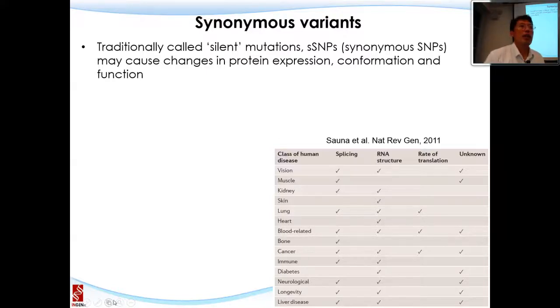Yes? These variants are not considered non-synonymous variants? Which part? The one which is predicted. Which I mentioned for the regulatory variants. No, they are not considered. So non-synonymous variants have a very specific definition. Those are the nucleotide variants that will change the amino acid sequence.